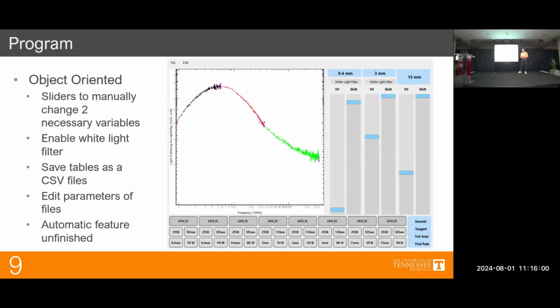Okay, so if there are two peaks, how do you compare the two? Because you say you don't look at the intensity of that. Yeah, so the idea is we just make them tangent. The spectrum is completely tangent with itself. So even if it's completely arbitrary, you would just add the Raman right here. It has to attach here. Oh, I see what you're saying. See what I'm saying? Yeah.